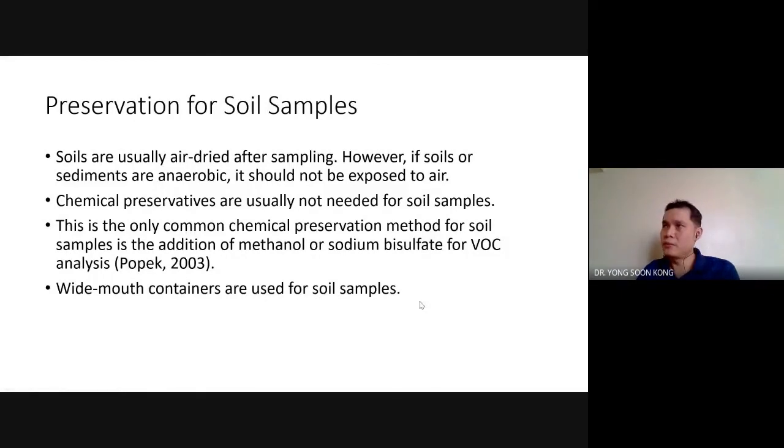Okay, now for the containers, wide mouth containers are used for soil samples. I have no idea why exactly wide mouth. There is a reason actually, there is a reason why wide mouth containers are used. I just couldn't remember why. But yeah, for VOC only, wide mouth containers are being used. Apart from glass, dark glass.